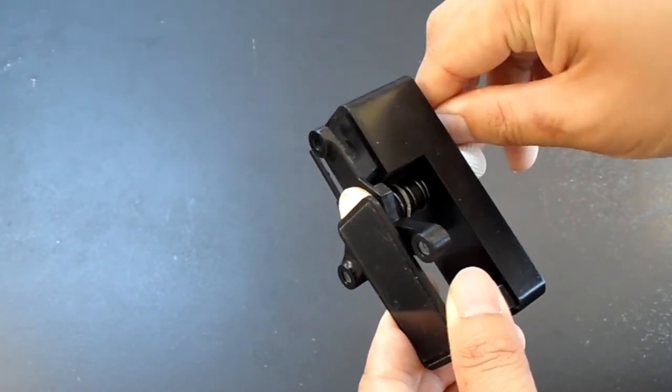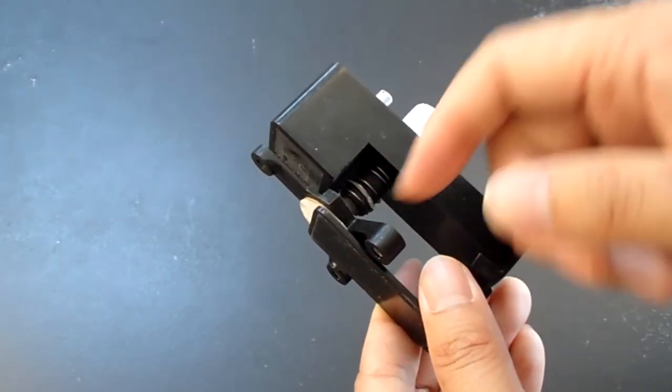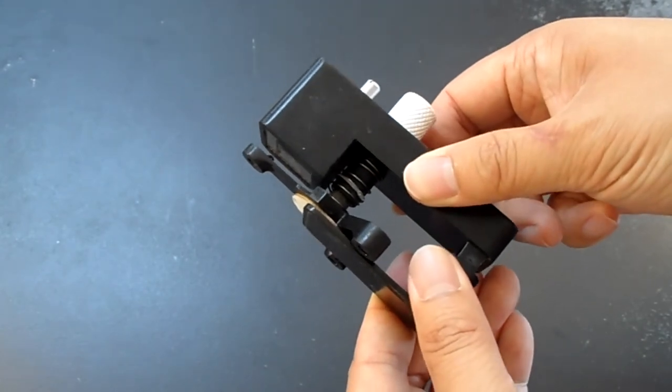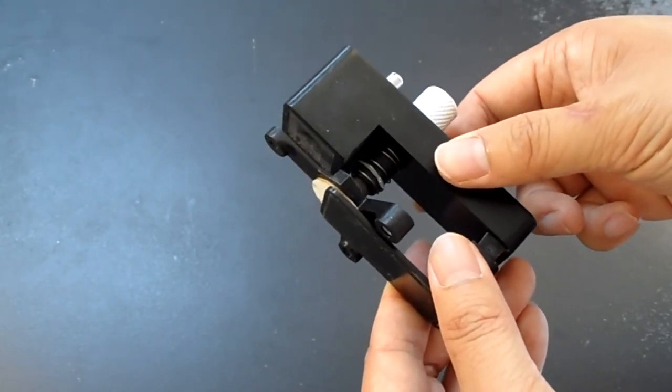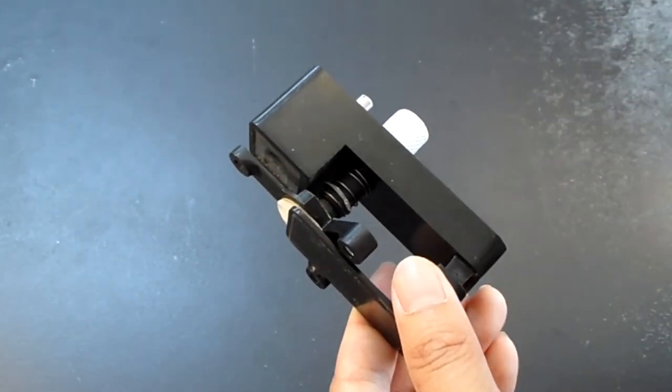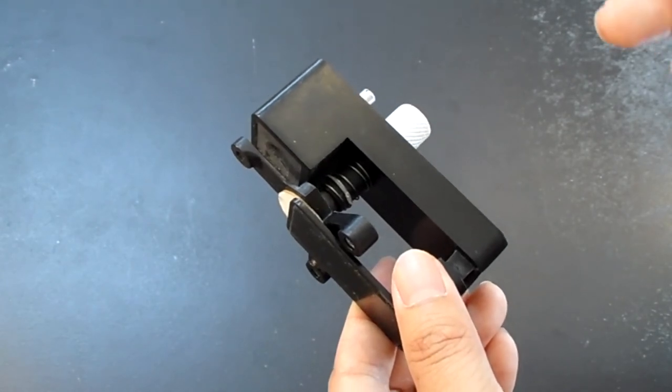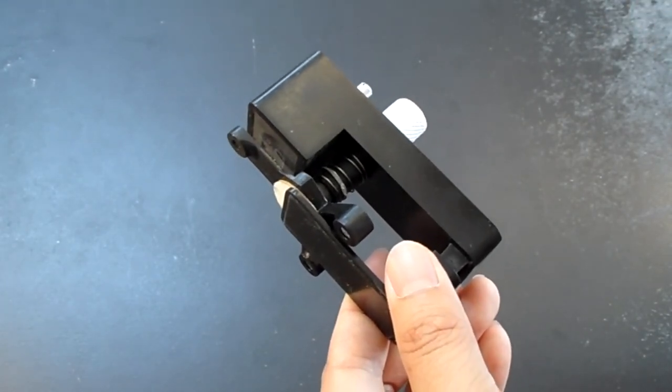Some things we are going to include are machined aluminum tubes, because we have this wiggle in here right now and we want to get rid of that as much as possible. All these things are bundled with the pledge because we want to make the best microscopes possible.